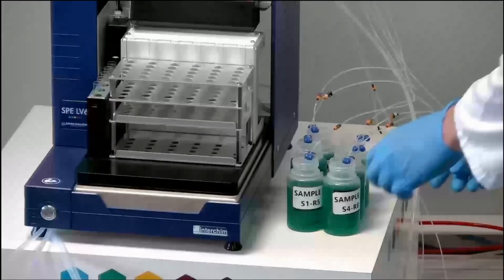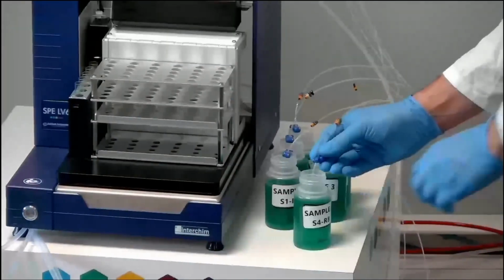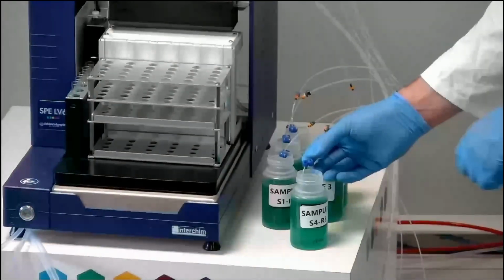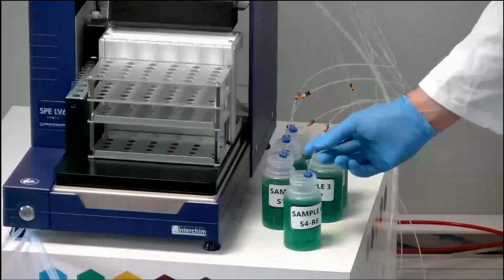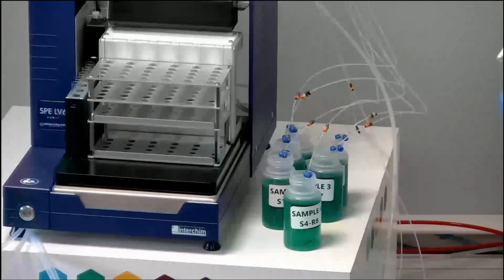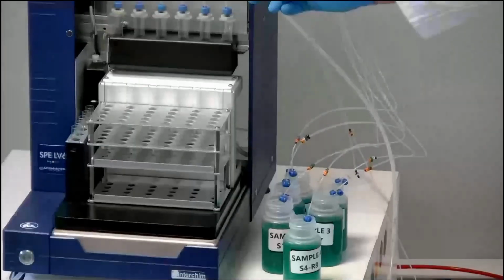For example, here, you can use these very nice tools to plug your tubing and to be sure that your sample line is at the bottom of your sample flask. Here, I have 6 positions. And in this case, we will use 4 different solvents.